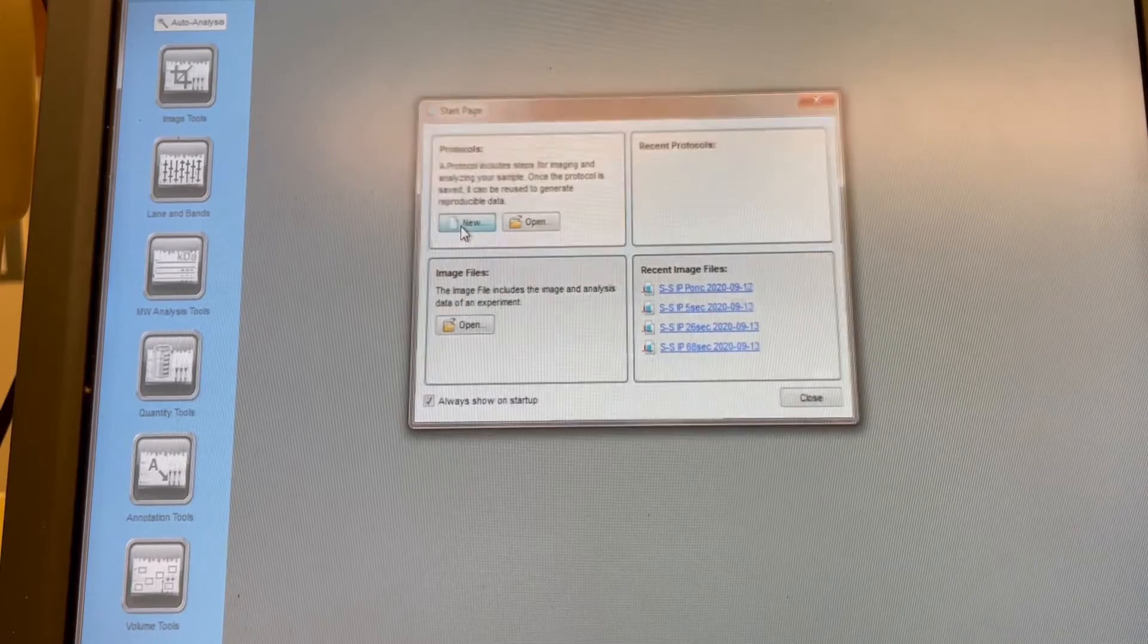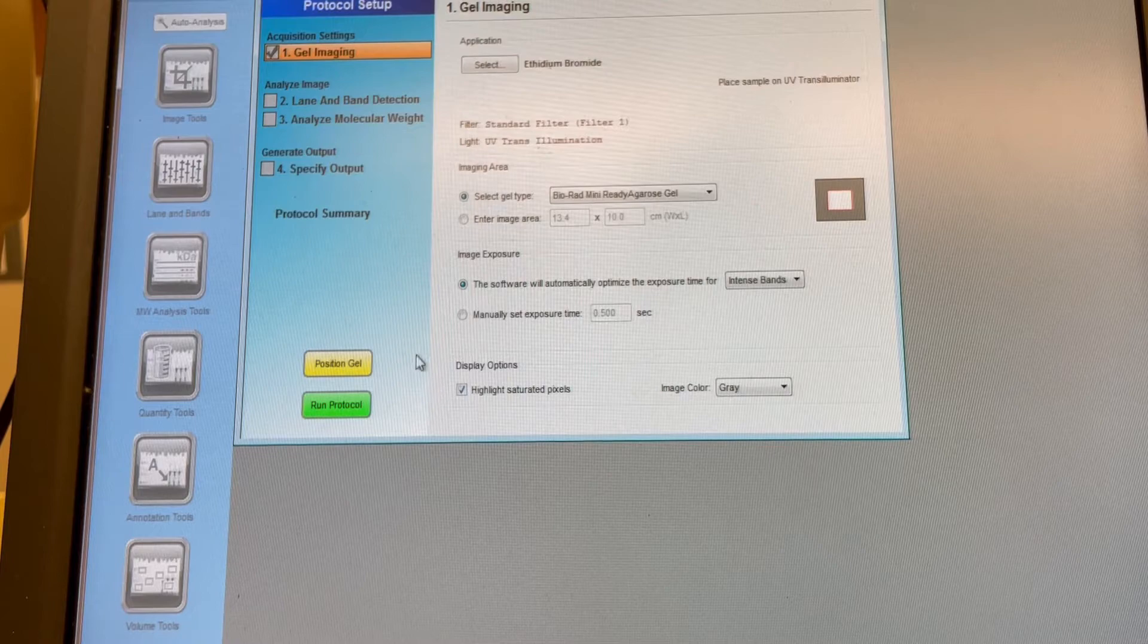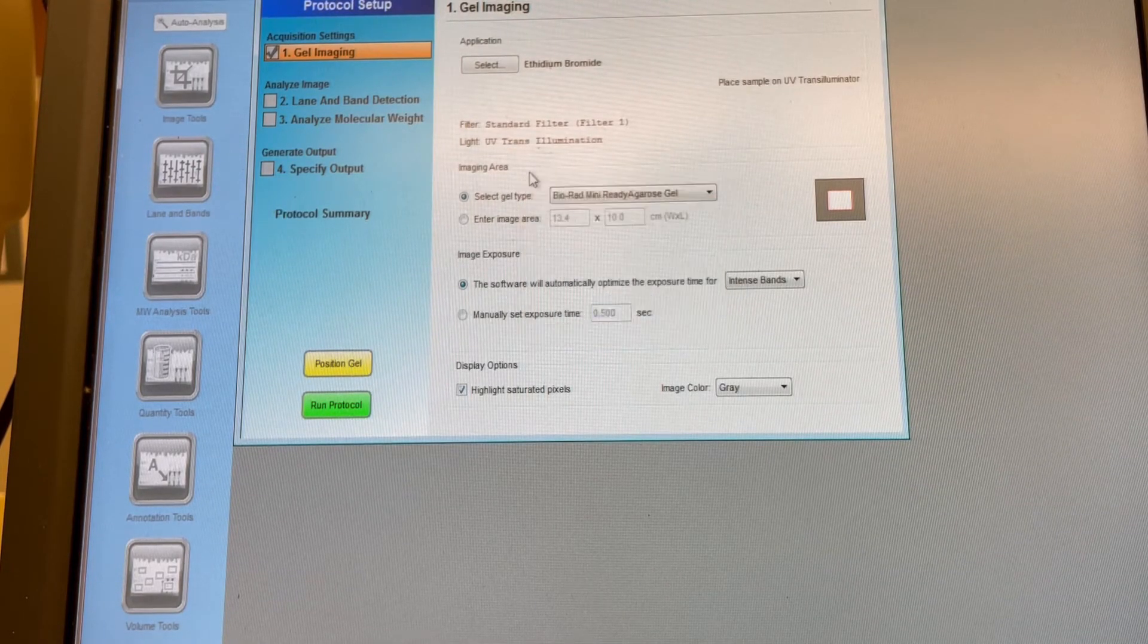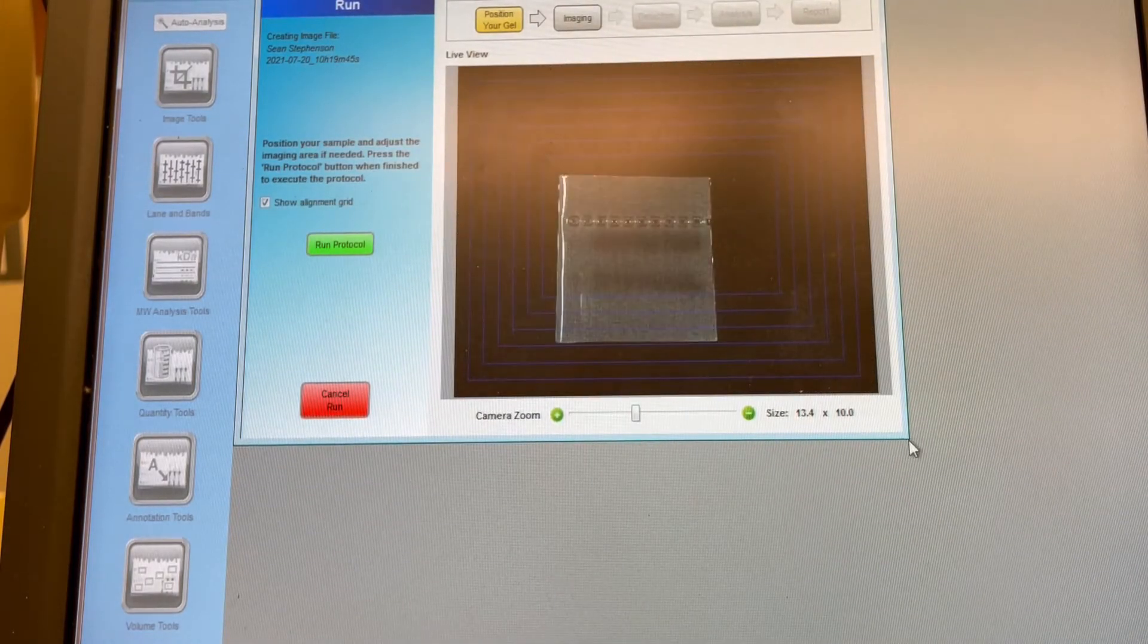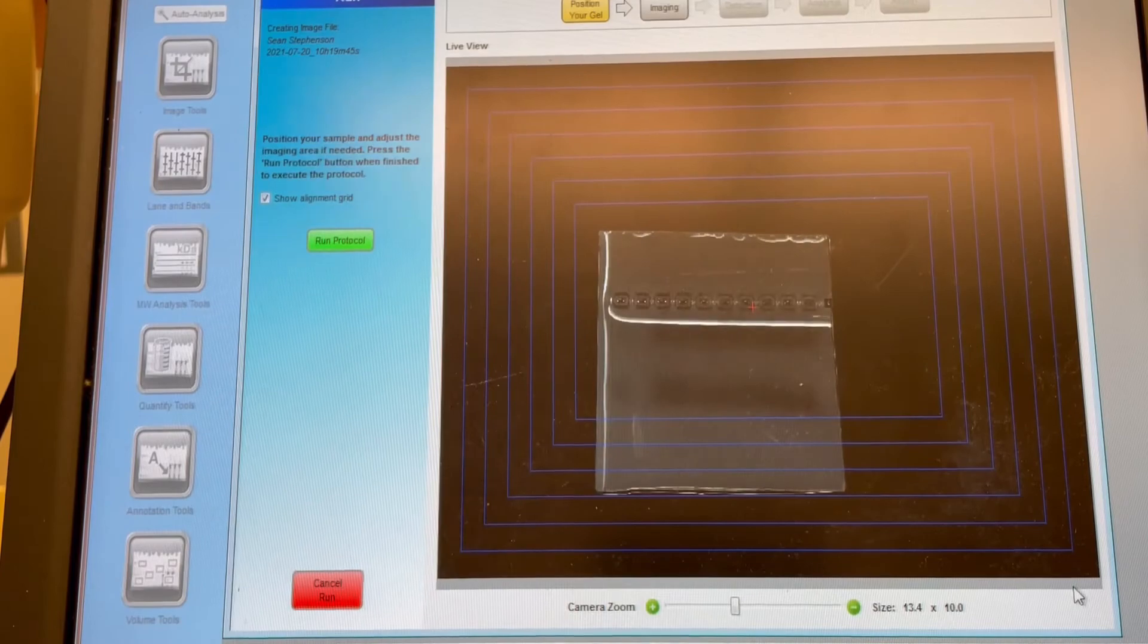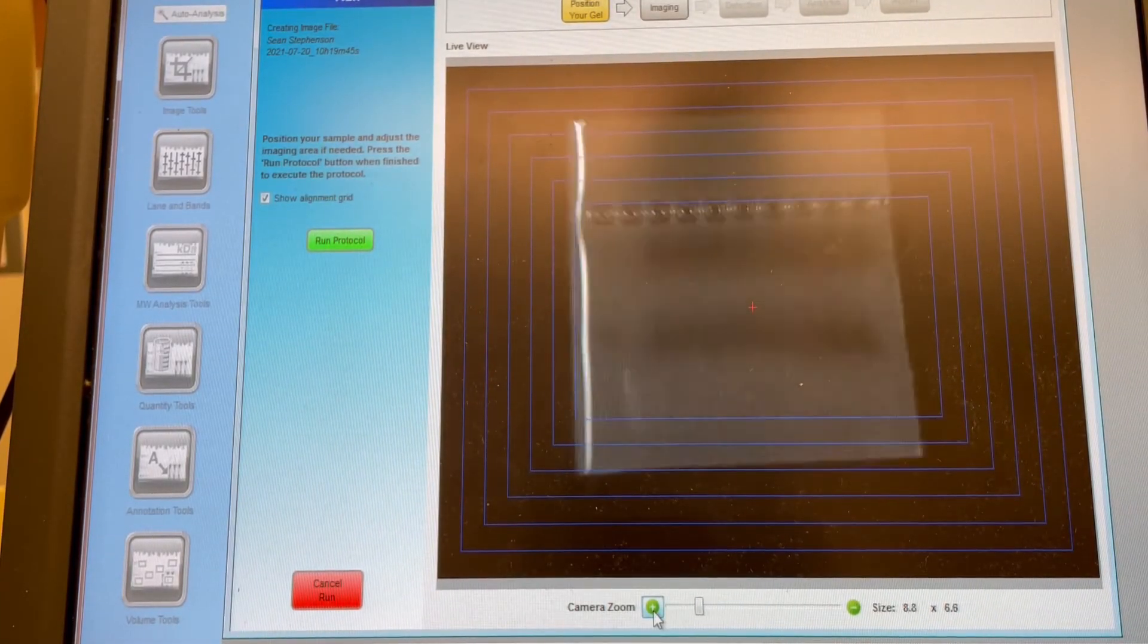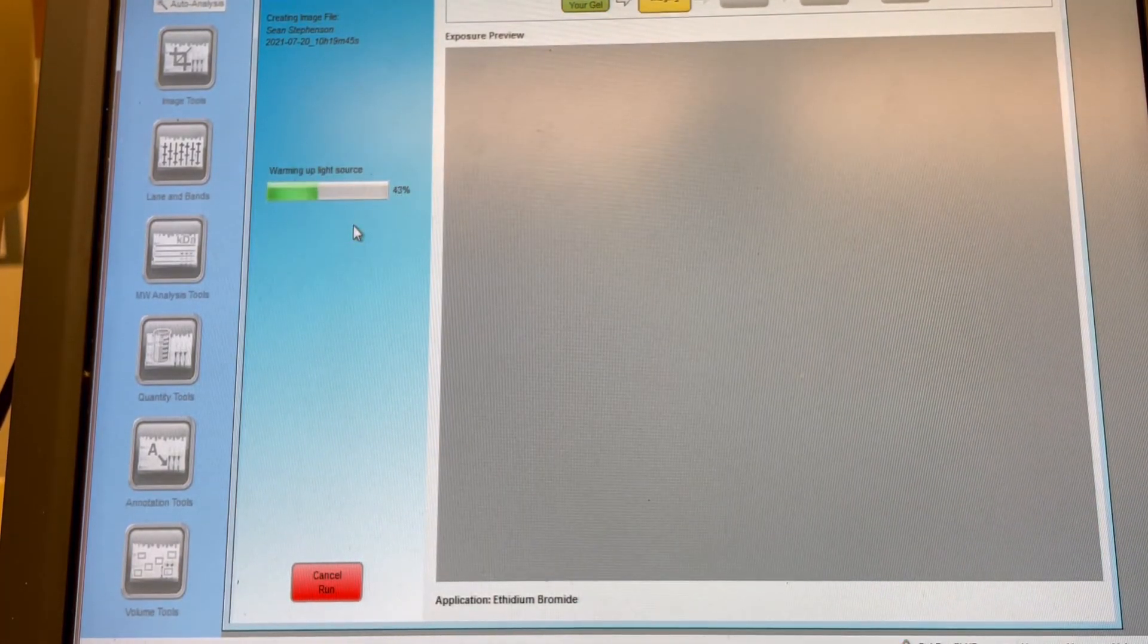The last thing to do is to image the gel. Make sure you use UV light so we can see the ethidium bromide that's bound to our PCR product. And then say a little prayer while you watch the loading bar go across the screen.